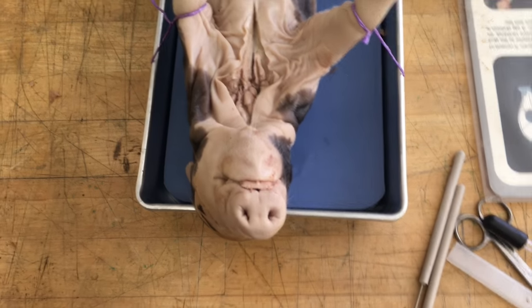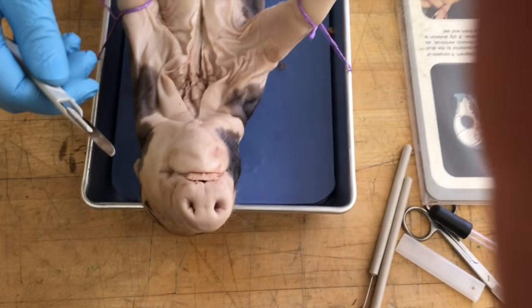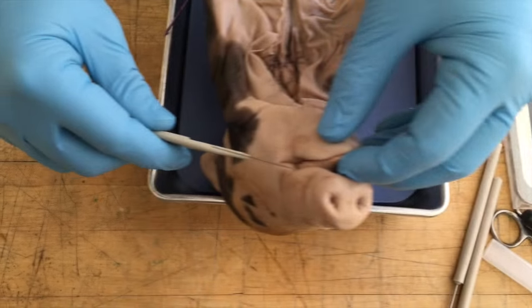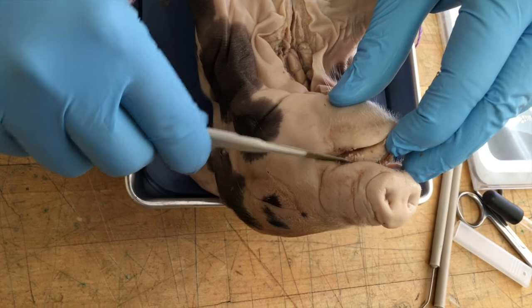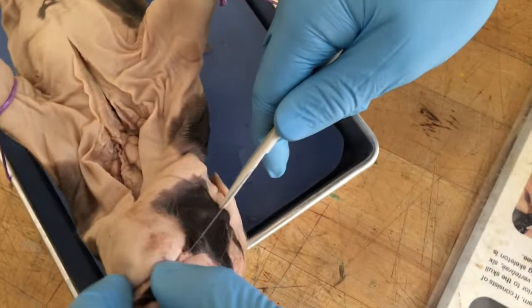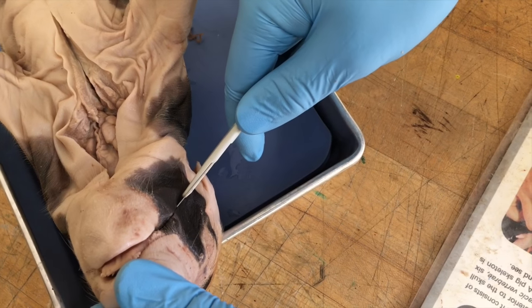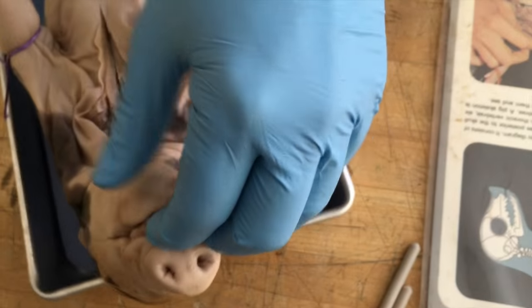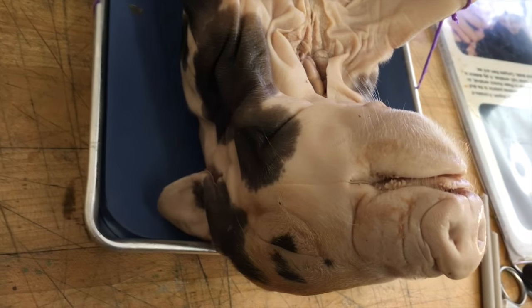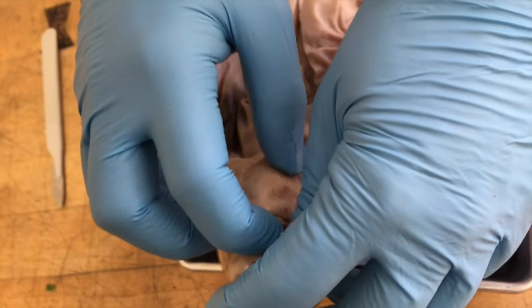Step four: we are going to make some incisions at the lower jaw and hinge its mouth open. We're going to start right here at the corner of the mouth — kind of like the Joker — and cut right down to the side. You can also see in the picture the nostrils to the left and the rigid hard palate, which we're going to see in just a second.